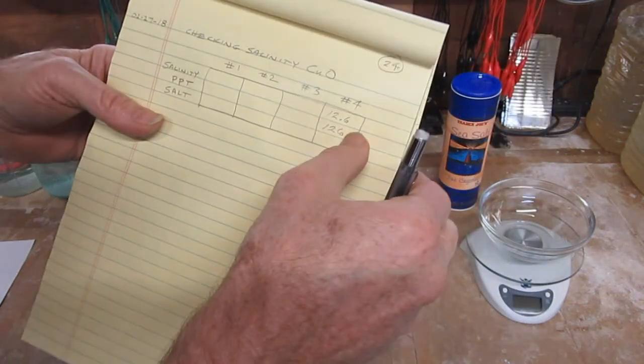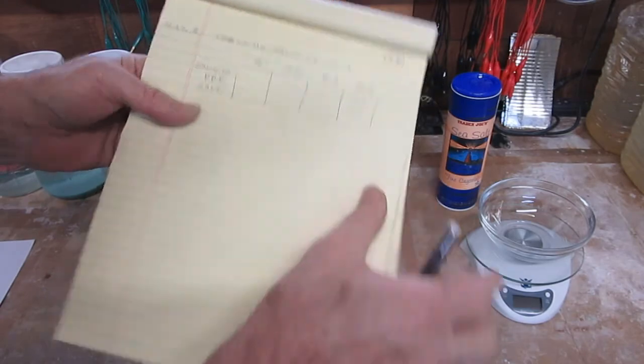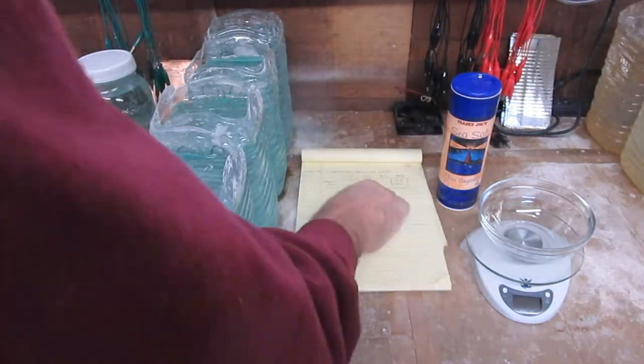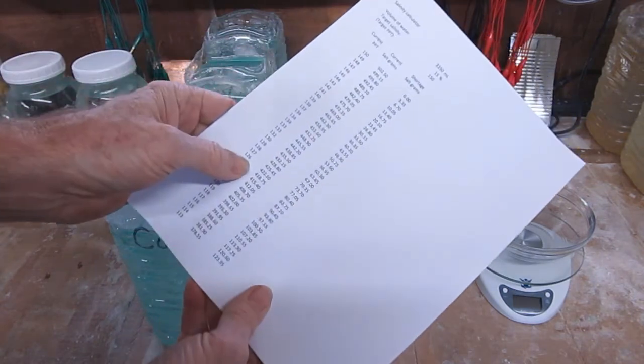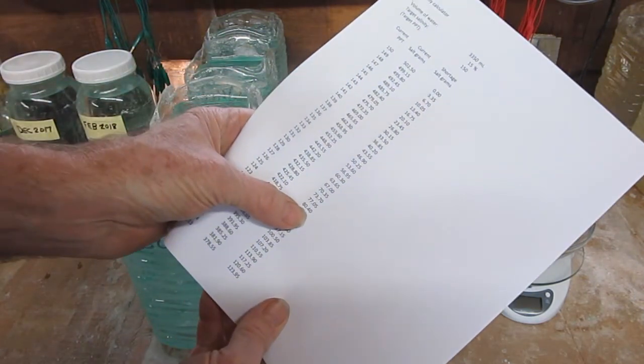The salinity reading of 12.6% is 126 parts per thousand. The spreadsheet shows that I have to add 80.4 grams of salt to increase the salinity from 12.6% to 15% for 3,350 milliliters of water.